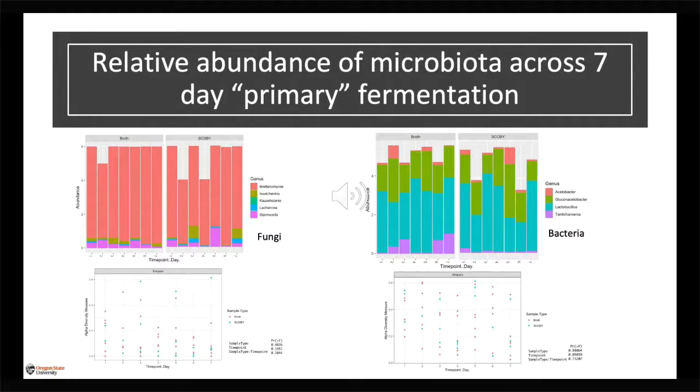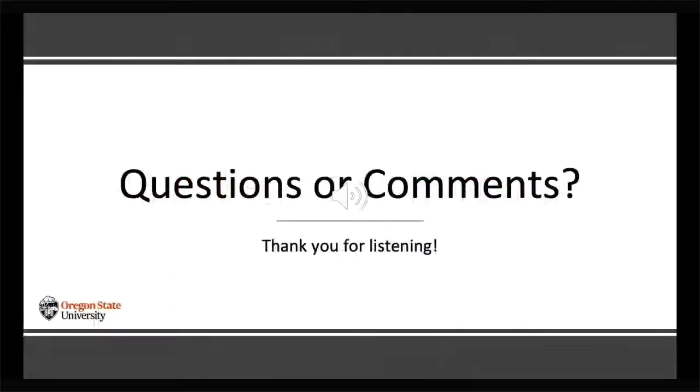From these figures below, we can confirm that there was not an observable or statistically significant relationship between time points or ages of the fermentation on the microbial composition. Phyloseq was extremely helpful in being able to validate the null hypothesis.